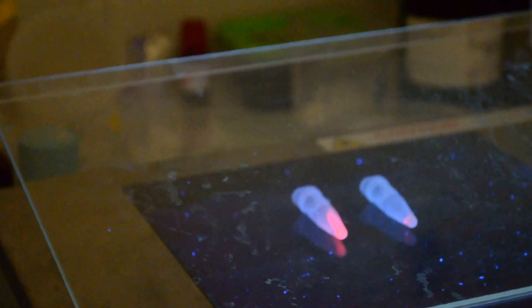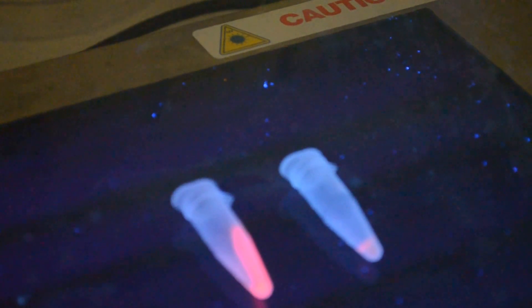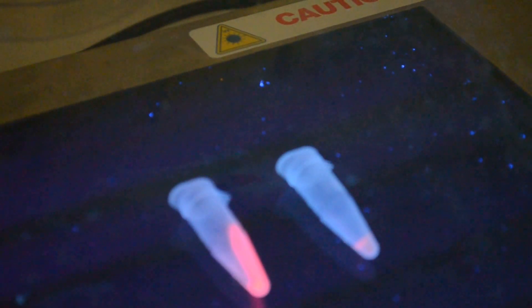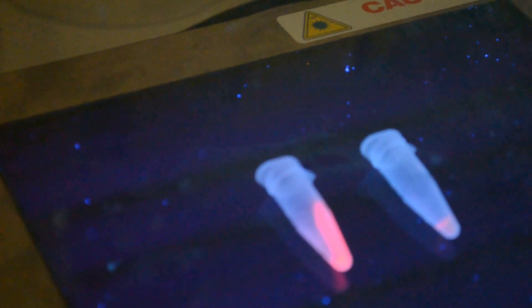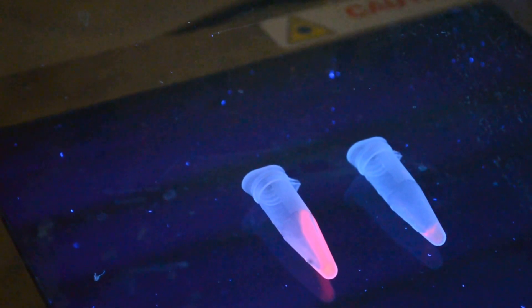Let's see. Here we go. Now, let's see what happens. Look at the test sample, the one that was added with the reagent. Indeed, making the quantum dots all go into the porous structure of the silica particles, while you have the same amount of the test sample showing no quantum dots. There is little tinge of fluorescence lingering in the control sample that is not derived from the silica particles. Rather, it is coming from the supernatant.